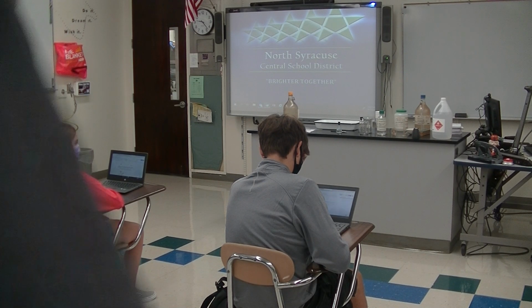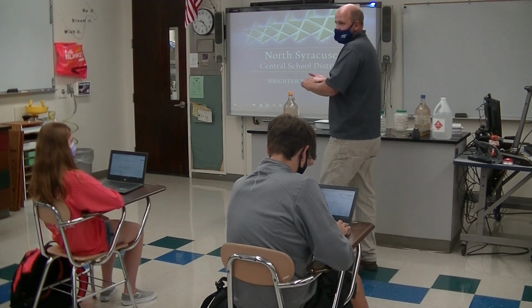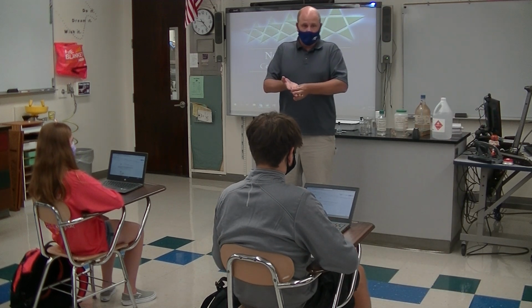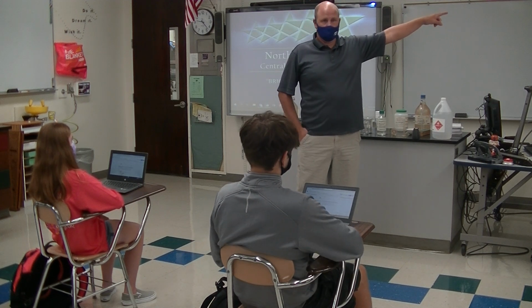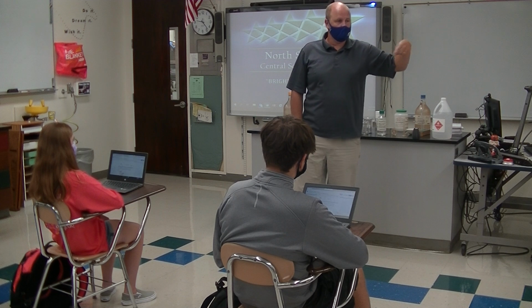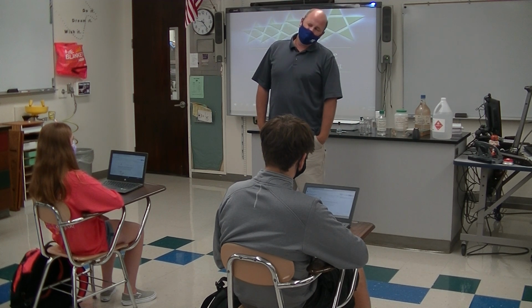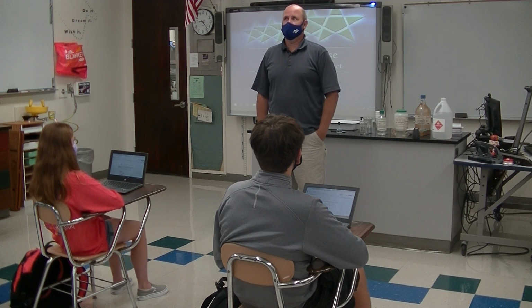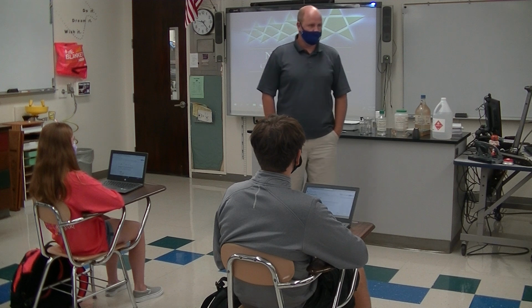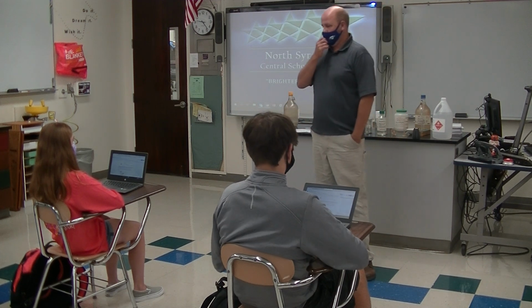Okay, all right. Do you guys know you're sitting in the most dangerous room in the high school? You are. Whether it's this chemistry room, the chemistry room next door, or the two chemistry rooms around the corner, these four are the most likely places for something to happen in the high school. In the past 15 years, there's been 6 or 7 evacuations of the building due to chemistry room issues.